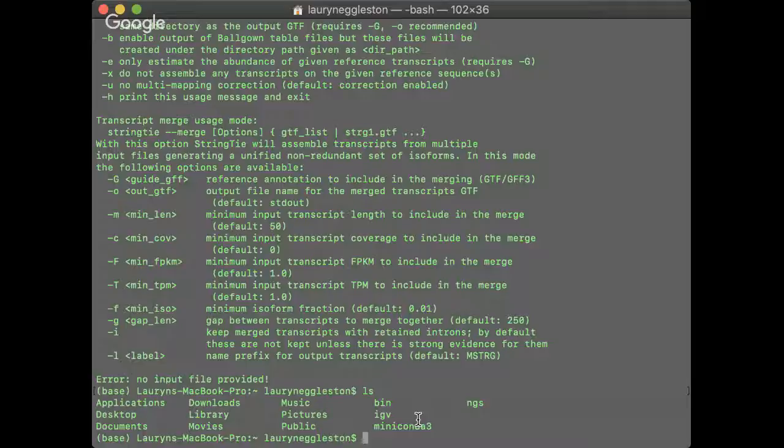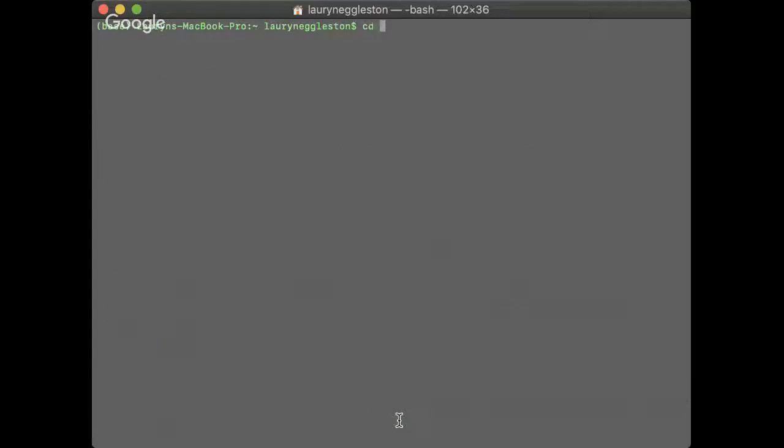And just because I wanted everything to be the same steps for the screencast tutorial, I was just going to go to the browser and download the source code for all of the software, so it would all be uniform. But Conda, if I was able to get it to work, is very fast and easy to use too. So I'm just going to clear my screen so it looks good.